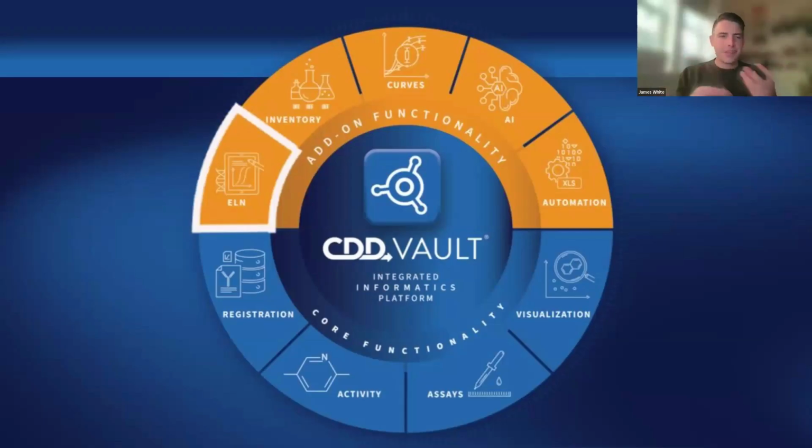So these enhancements are going to help chemists capture data faster, cut down on manual steps, and maintain a cleaner, more connected record system within their projects. And delighted that Kelly is leading this demo on this chemistry ELN update. So please take it away, Kelly.